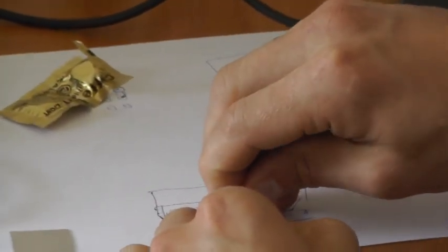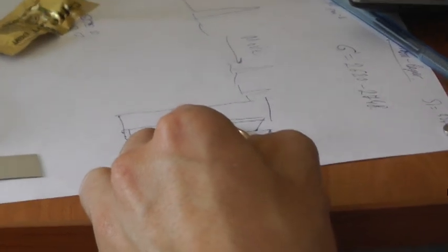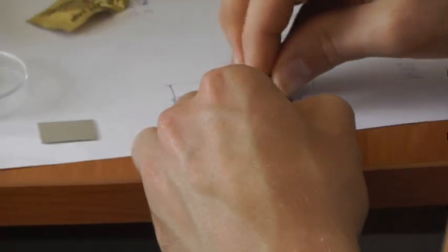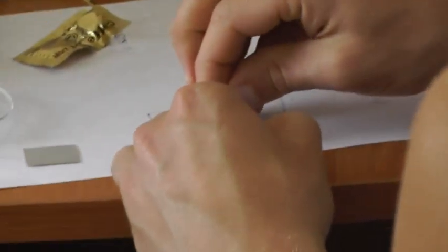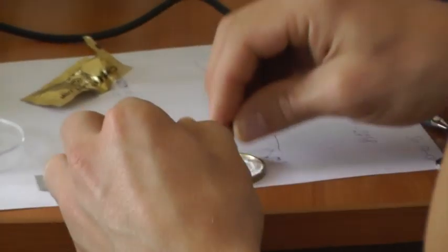And you will be able to measure a separate particle every time, and afterward we will have rich statistics of spectra recognized separately. It is enough.